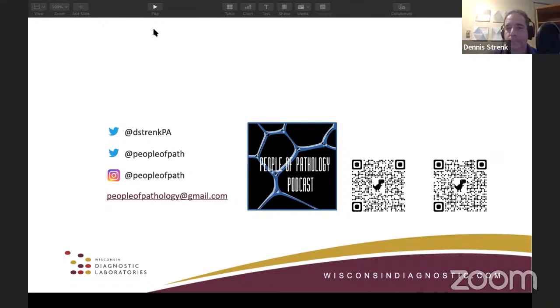So thank you for that. There is another comment from one of our viewers, that there are CAP protocols and also RCPath, Royal College of Pathologists of UK, data sets for grossing. I think this is something important, right? They have also very good grossing data sets that our viewers can use.